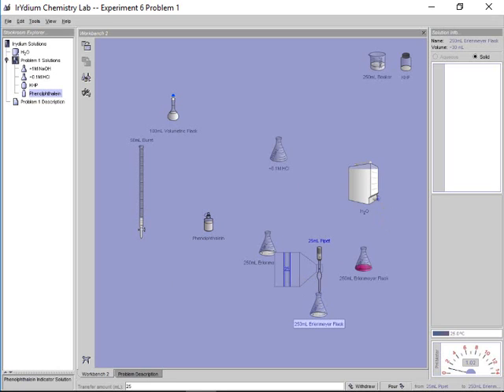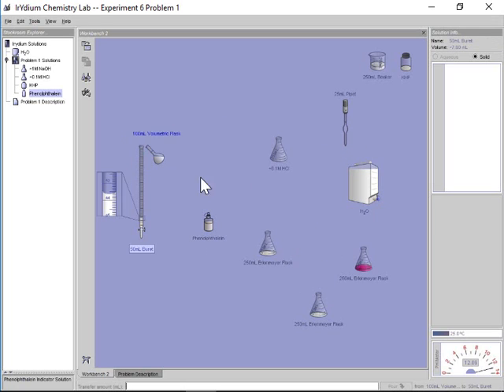So it looks like I do have enough. Hopefully I have enough of my diluted NaOH here. I'll show this all on the OneNote and how we did the calculations. Maybe I'll top it up some more because now we're doing 25 mils at a time. So toss in, I have about 6 mils, so toss in 30. Maybe I'll toss in another 10, right? So now, again, I'm not confident if I will have enough for both trials, but let's just try it out.